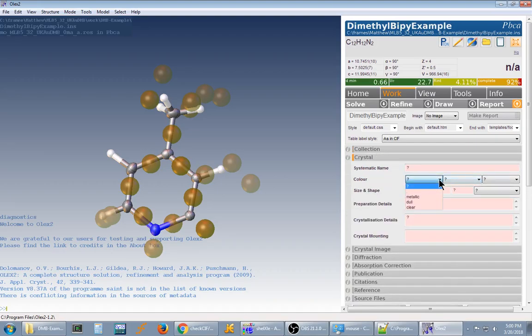Crystal, what color was it? Well, it was colorless. It was a plate. There we are, plate. I don't have handy what size it was. That's in APEX3, but you can put in your preparation details.